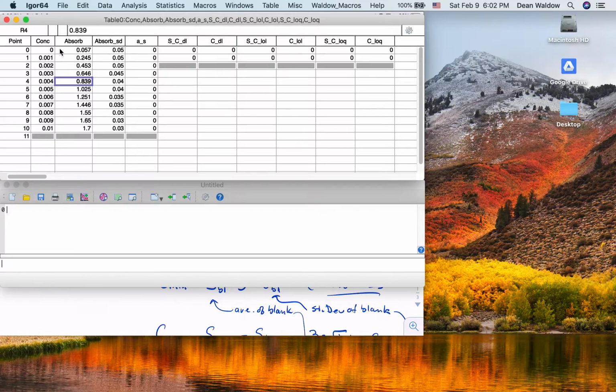And in terms of precision, we're going to think of that as the standard deviation of the measurement we've made. So in the lab, a student has probably measured absorbance multiple times and then calculated the average and standard deviation. And those are the values we are reporting. So to start thinking about figures of merit for this particular instrument and the calibration curve we're making, we need to plot that data and get the best fit to that.